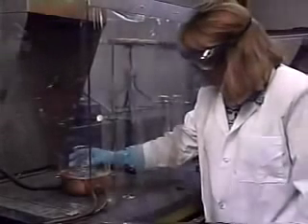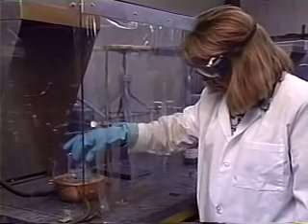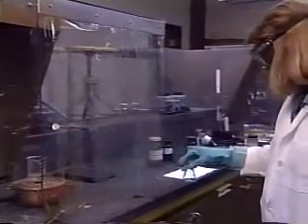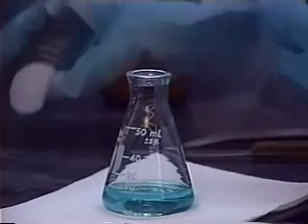Now that all of the material is in solution, add a milliliter or 2 of additional solvent to allow for evaporation in the procedures that follow. Swirl the solution and note its color, greenish blue. The material is most likely contaminated with a colored impurity.